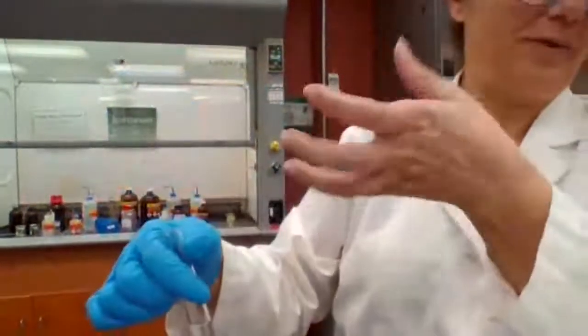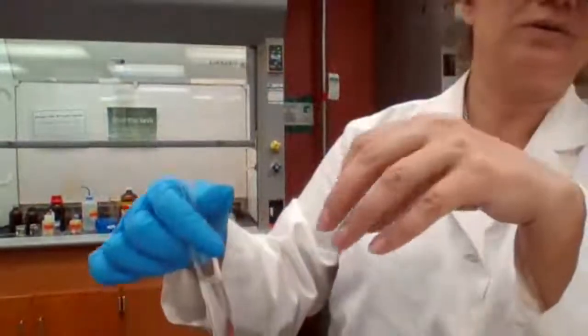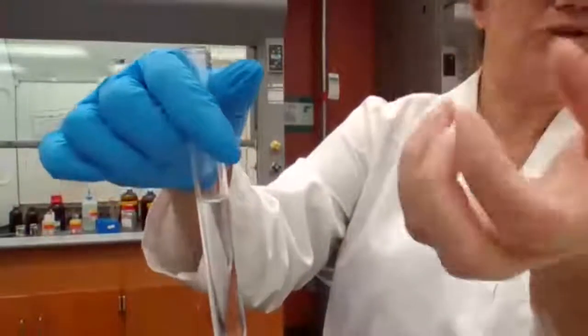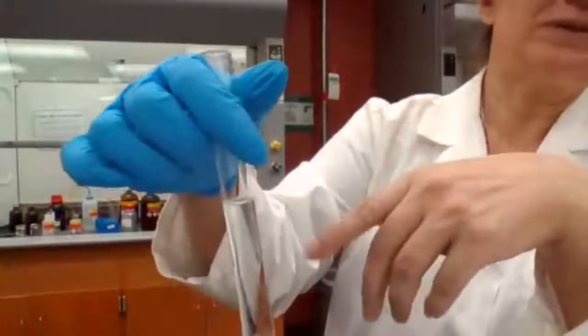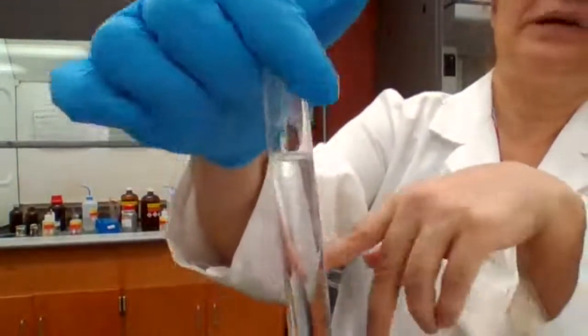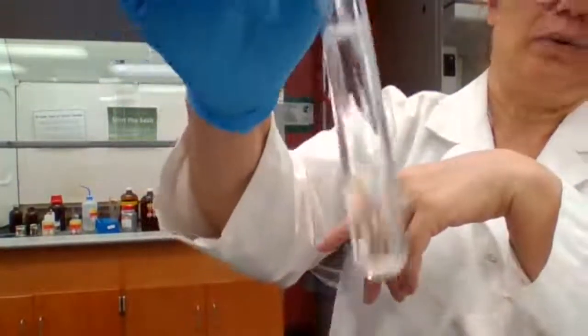Sometimes the bubbles are coming from shaking, so you get some air into the solid. But when it was continuous formation of bubbles, that means the reaction was taking place. But at this point, after 30 minutes, it completely dissolved and is one layer.